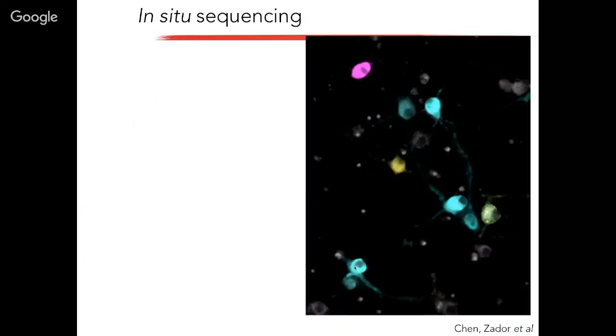So here's an example that I hope will clarify what I'm talking about. This is a picture of a bunch of neurons in culture. The bright circles are cell bodies. I'm showing you these pictures from cell culture because the pictures are prettier, but we also do this routinely now in slices. And so what you see is, here's the key for reading it out. Each neuron is full of one barcode derived, or in a couple cases, 2 barcodes, but typically 1 barcode derived from infection by our virus.